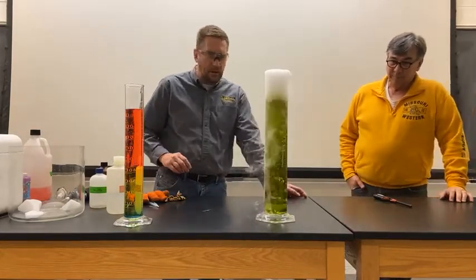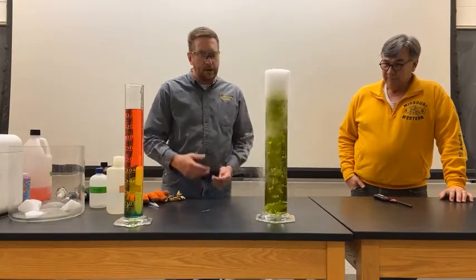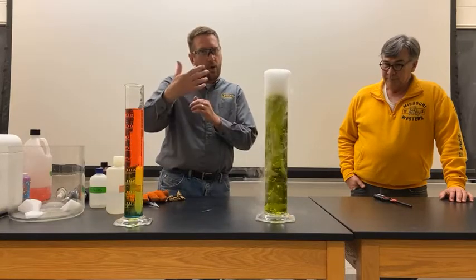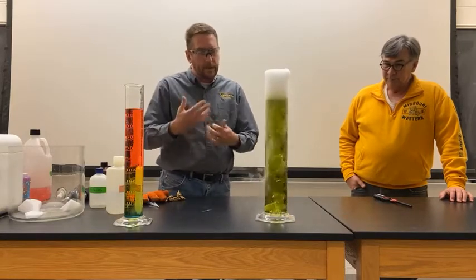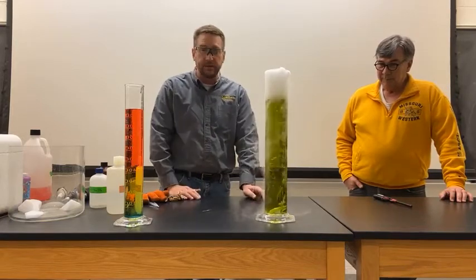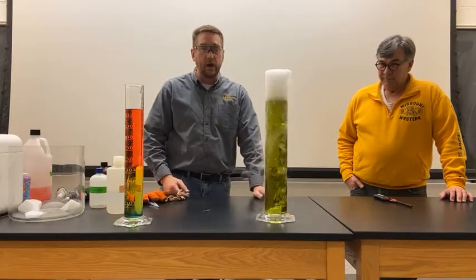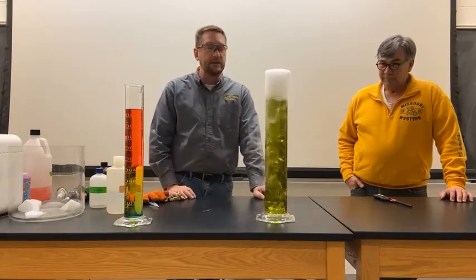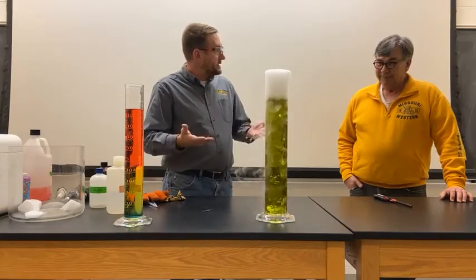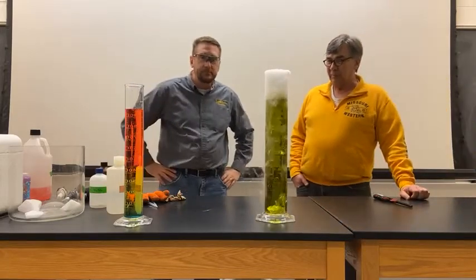Okay, so we're getting, again, to a pH around 6 or so. If we let this go long enough, it will get orange in color. It doesn't go all the way to red, but we've definitely changed the acidity, or the pH, of this solution significantly by dissolving our carbon dioxide into it. So I think that's what I have. I think that concludes our CCEW experiments.